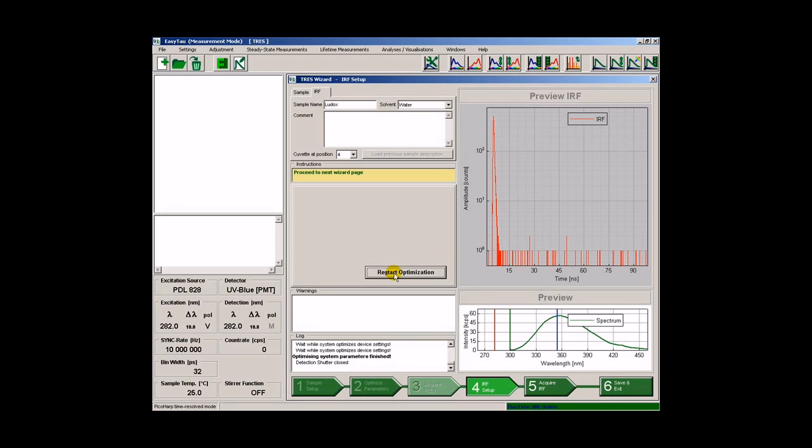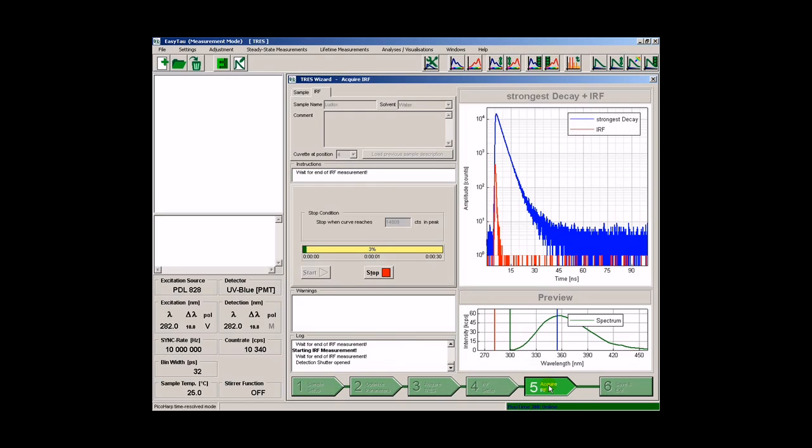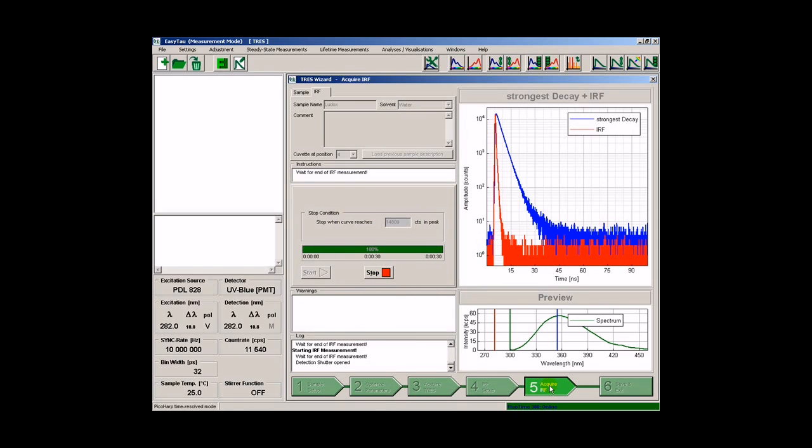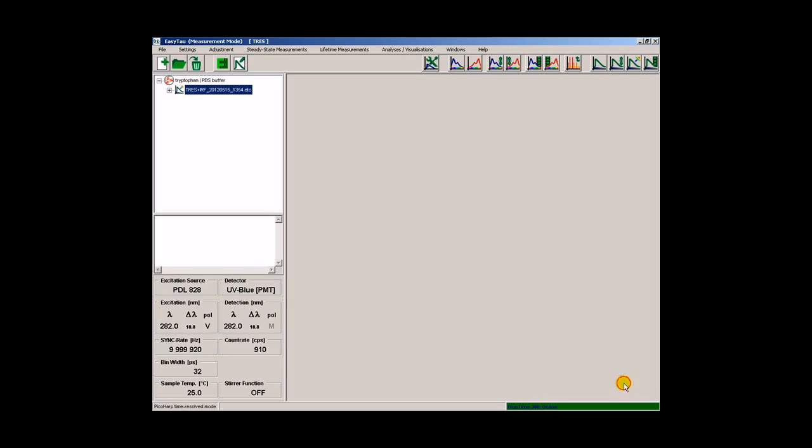When the optimization is finished, we can proceed to the last step and acquire the instrumental response function. Finally, we select to save the acquired data and exit the wizard. This creates a container containing all the measurement data in our workspace here in the left pane of the EasyTau software.